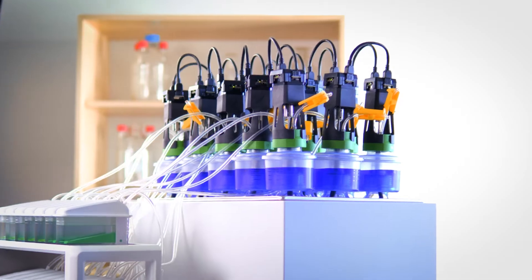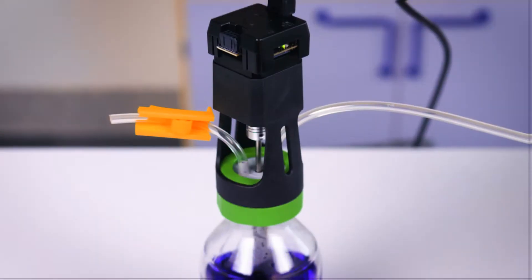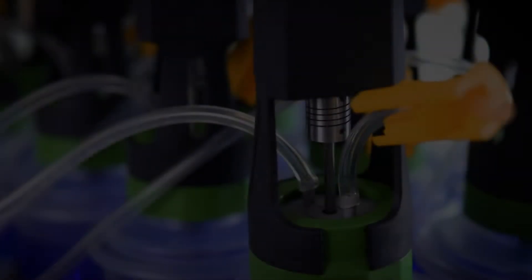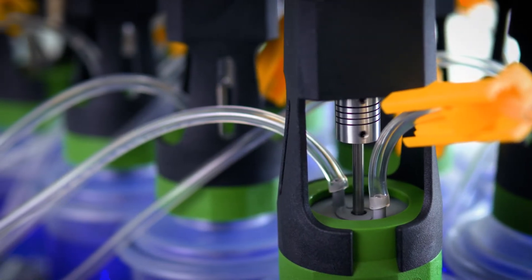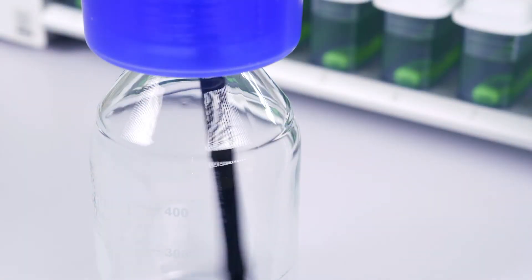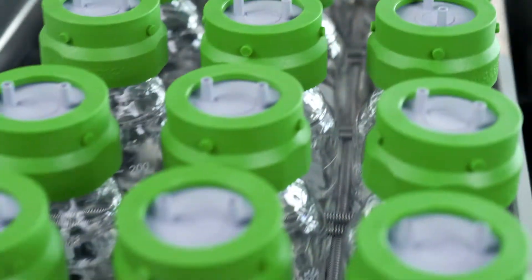Let's have a closer look at the incubation unit first. It consists of 15 standard bottles in which the ingredients of the experiment are added. Each bottle is connected to an agitator that ensures a well-mixed content. Set the direction of the mixing. For sensitive samples, a shaking water bath is also available.